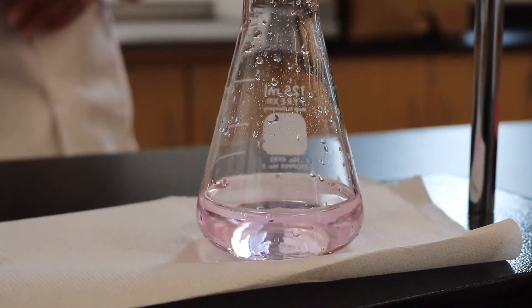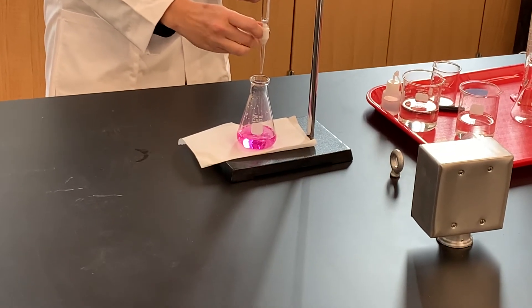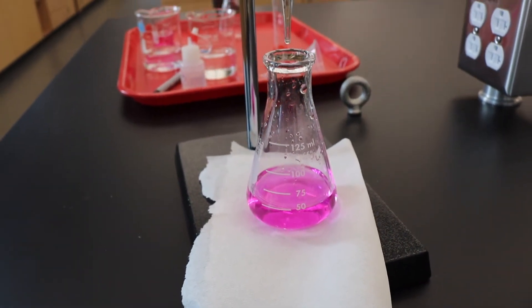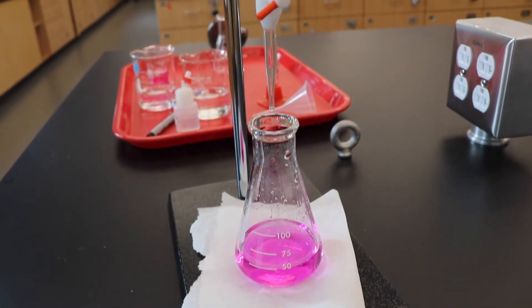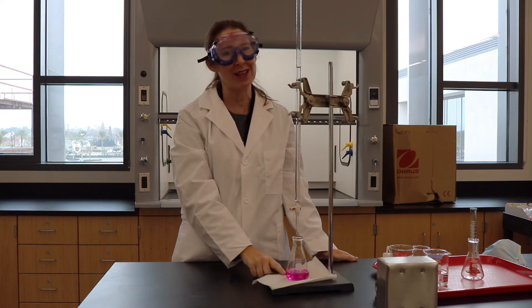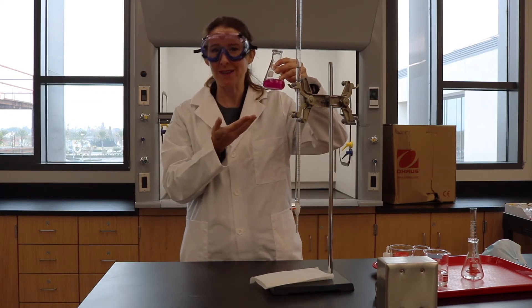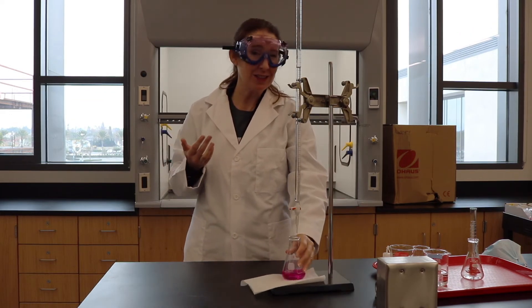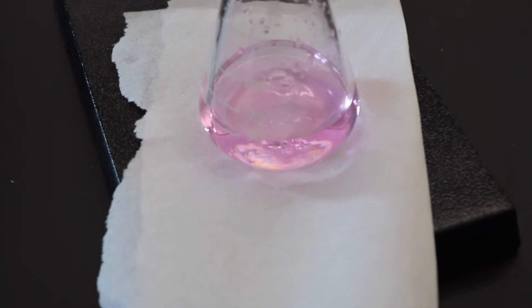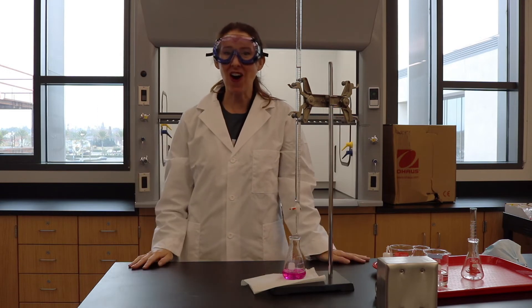It goes away after about 30 seconds, as you can see. If you add too much, this is what happens — it turns really bright pink, and we call this fuchsia. That means we've done a horrible titration. We always want a really light pink, like you just saw. If you take Chem 219 with us, the first time you do a titration you'll probably end up making this fuchsia color, but by the third time it will be a magnificent baby baby pink. That is our demonstration of a titration.